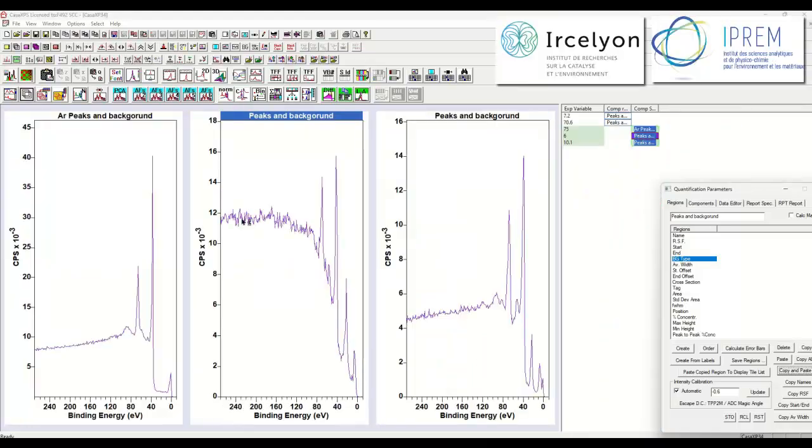It's worth looking at these component peaks in detail. So we've got two that represent signal that you might think is consistent with a bulk material. One is metal and the other is an oxide, and the reason I say that is because the background declines away from the photoemission peaks in both cases. Perhaps less so in this case, but certainly in this particular case of the metal we have a very characteristic shape for a bulk metal vanadium signal.